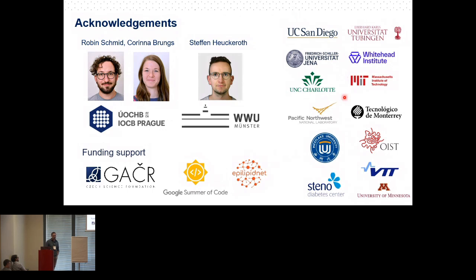Yeah, that's a great point, and I did not specifically mention that, but we can use this ion identity networking to annotate the adducts directly in the data that comes from the data collection of the library. So all these different adducts will be included.